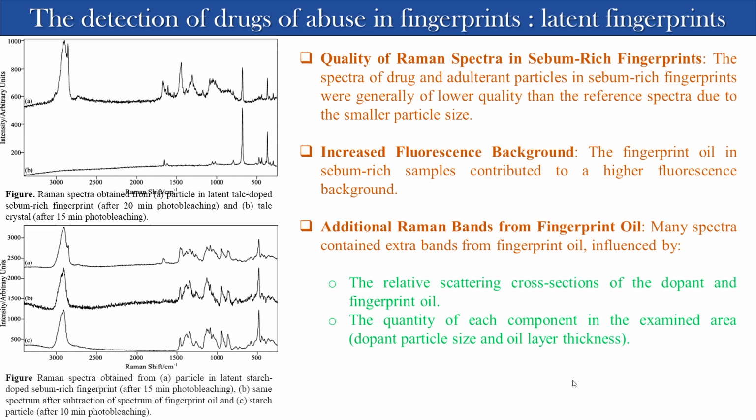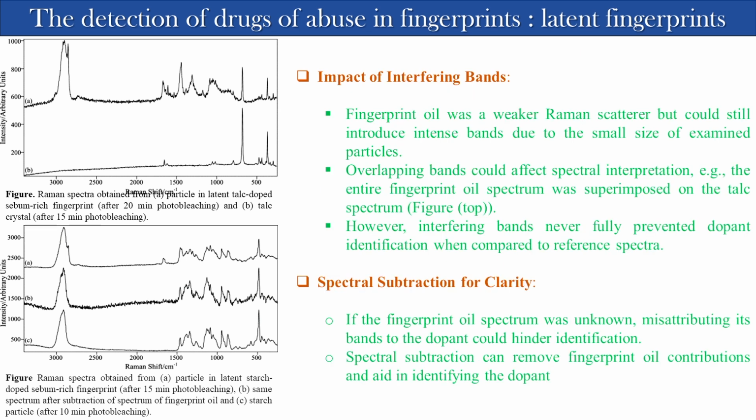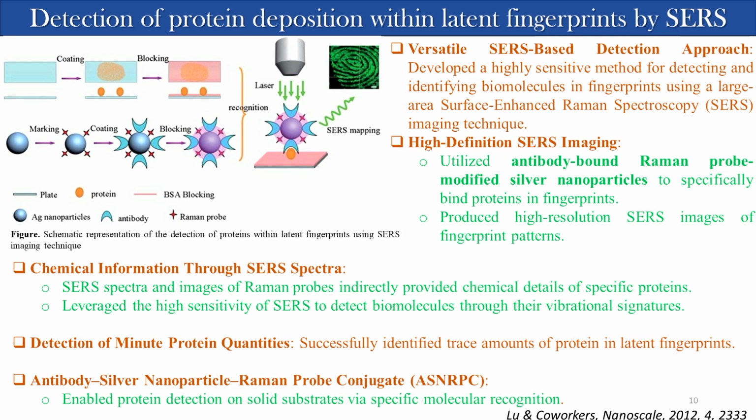For correction also, there are many people doing just correction of the sample, correction of the background. About 2 years back I went to a Raman conference. There was a section in which three groups presented, and all three presented on how to analyze the Raman spectrum, how to get a corrected Raman spectrum from uncorrected raw data.